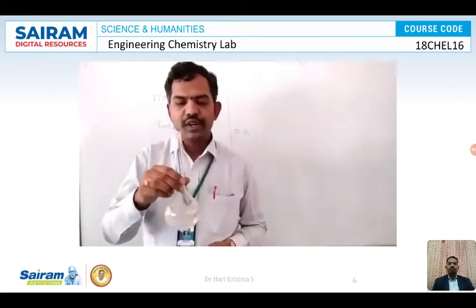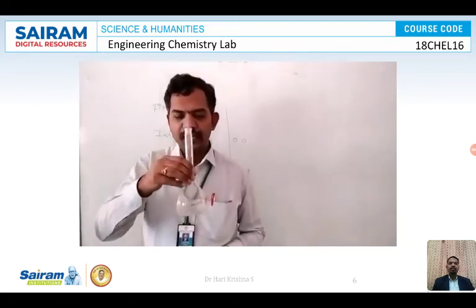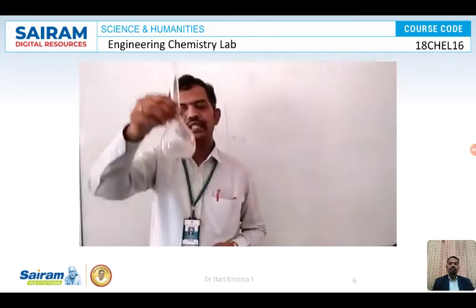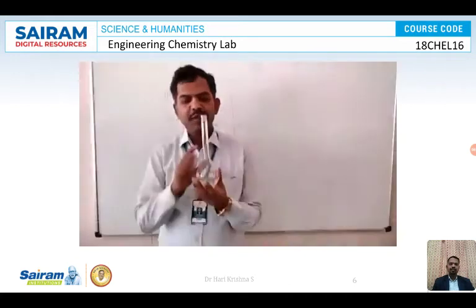So we are going to dissolve the crystals completely by swirling. This is called swirling. The crystals are dissolved. You can see the crystals are completely dissolved. So now we are going to add water up to the mark.